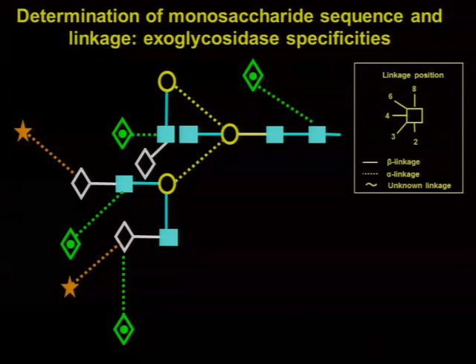And make sure you use the conditions that they specify, right? Don't just go on incubating for days, because you'll get contaminants that are in lots of the enzymes that you buy, and they will start to become important. They'll start to activate. And if you keep very high concentrations as well, you will have other specificities. So this is the answer: just use what we have used for years and that works.